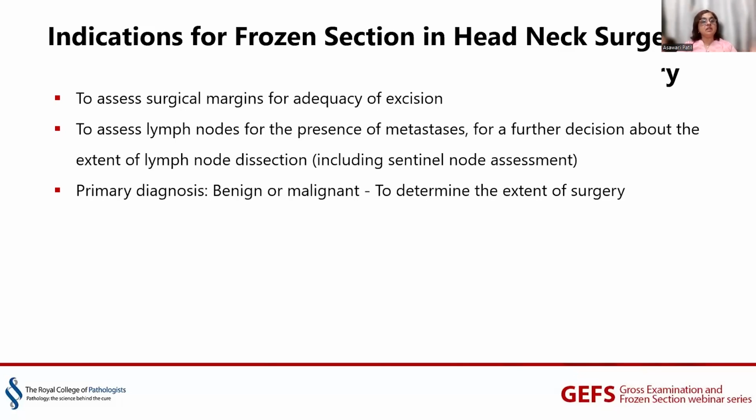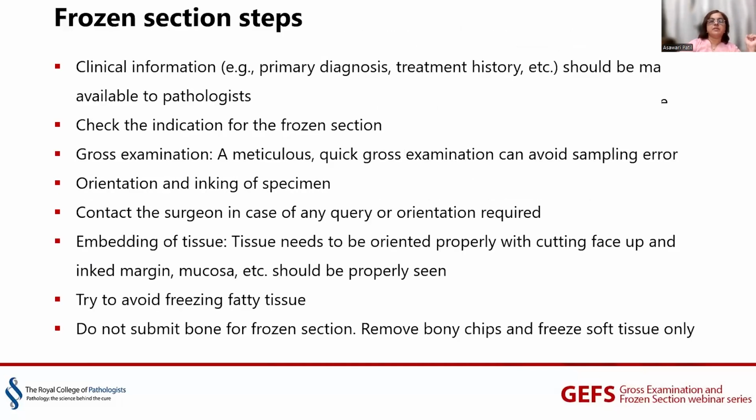Sometimes you may get a segment of a nerve that is cut and inked, and we are supposed to see whether this is involved by tumor or not. So here, we mainly look to assess the adequacy of the surgery, which is important in that case.